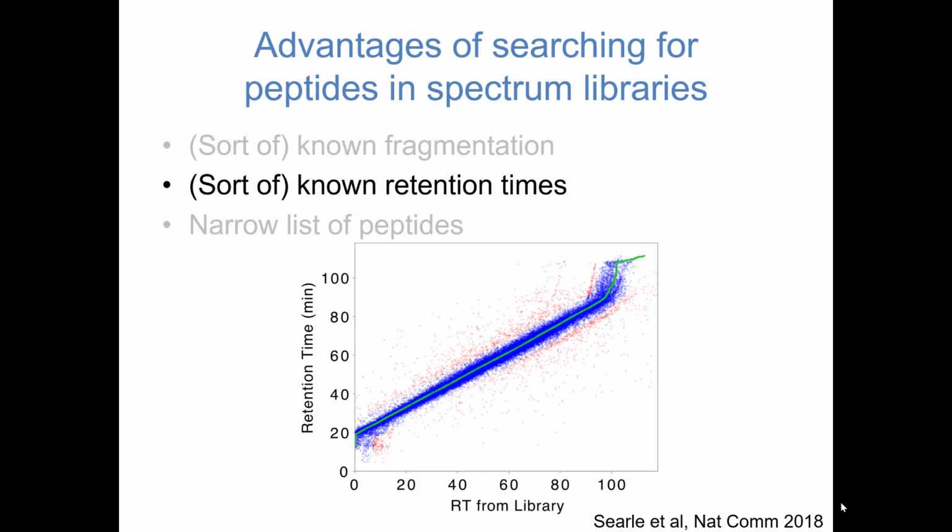And that cuts out a lot of the search space. So if I only extract out a ±5-minute range, then I'll be pretty likely to get these peptides, and I won't have to look at all of the other sort of garbage around in space around them. That said, it's never quite that perfect.